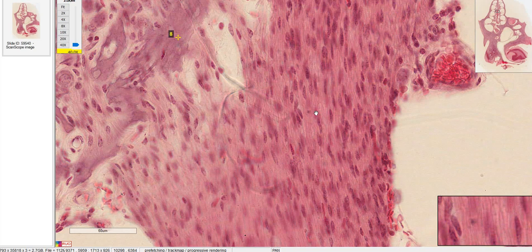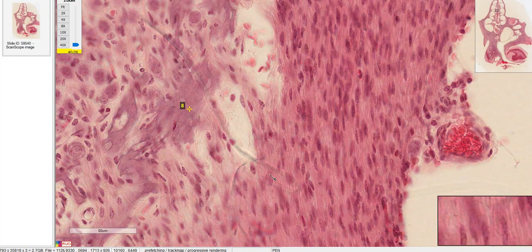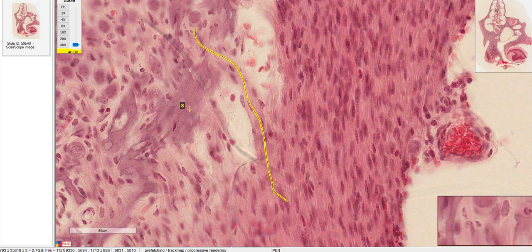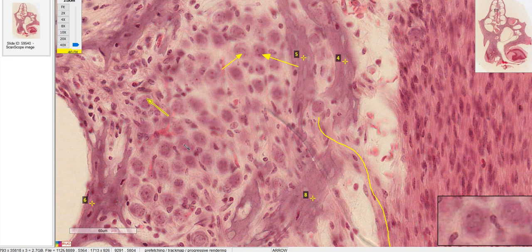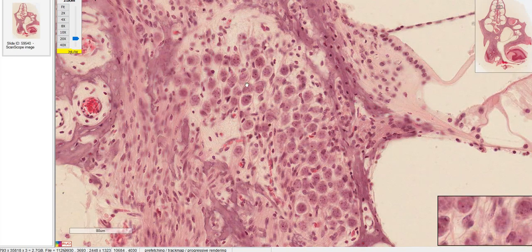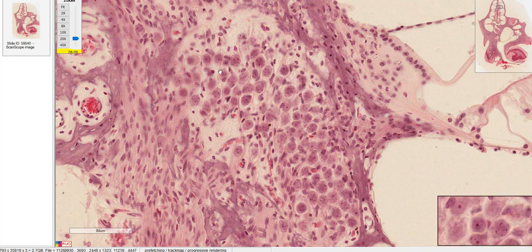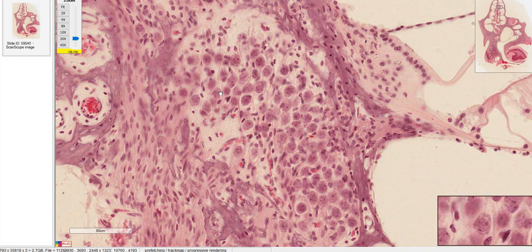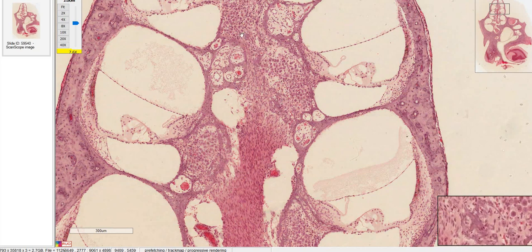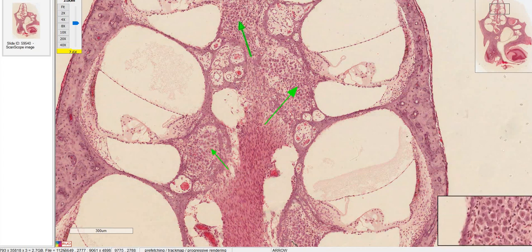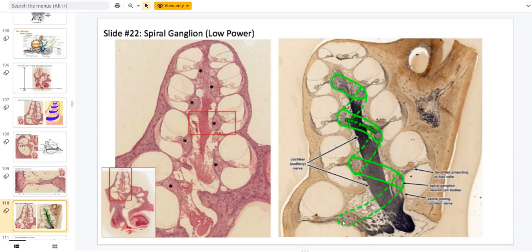Unlike the optic nerve, which is myelinated by oligodendrocytes, the cochlear nerve is considered part of the peripheral nervous system, so it's myelinated by Schwann cells. If you trace the path of some of these axon fibers back, you can see they're going toward these structures, which are neuron cell bodies. Whenever you have a collection of neuron cell bodies like this in the PNS, it's called a ganglion — this in particular is called the spiral ganglion. Each one of the cross sections of the cochlea has its own piece of the spiral ganglion, and the spiral ganglion is continuous in a spiral fashion.